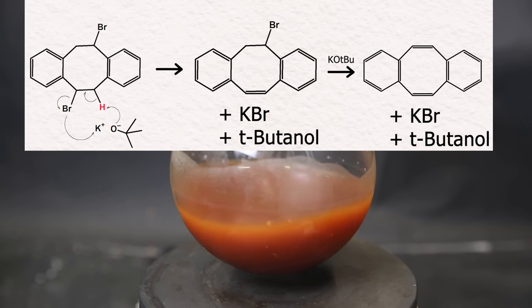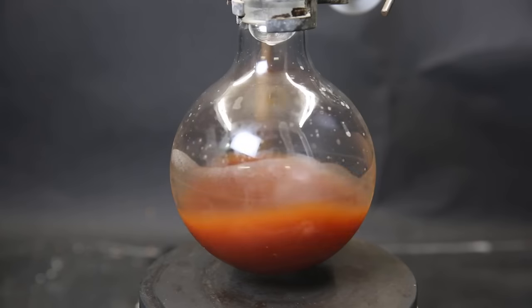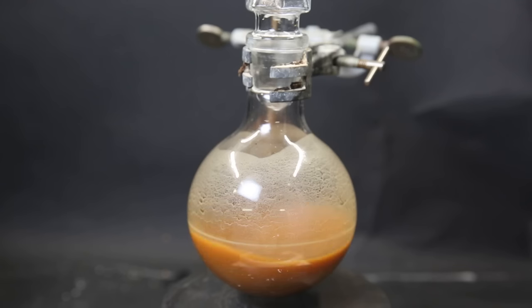This causes the electrons that originally formed the bond with the hydrogen to move and form a double bond instead. Now this causes the carbon the bromine is attached to to have 5 bonds, which is not possible. So since bromine is a good leaving group, it will gladly take its bond electrons and leave to bind to the remaining potassium ion instead. And after that, balance has been restored. But there's still some more KOtBu, so this will happen again on the other side of the molecule, which will form the final product. So after it has been stirring for 3 hours at room temperature, the reaction should be complete.